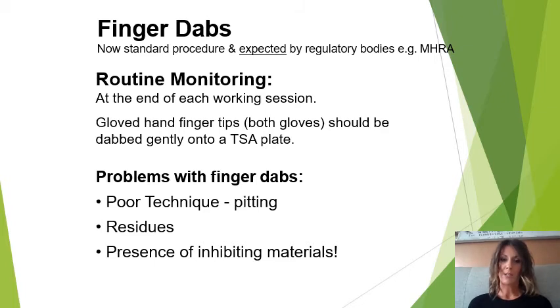The problem with finger dabs is obviously if you press too hard, you rupture the surface of the agar. You don't want to leave a residue behind on your gloved fingers and then carry on producing, because it provides, again, a lovely surface area for microorganisms to proliferate. So you want to make sure that after you've taken your finger dabs, you then clean your gloves or change them, depending on your processes.